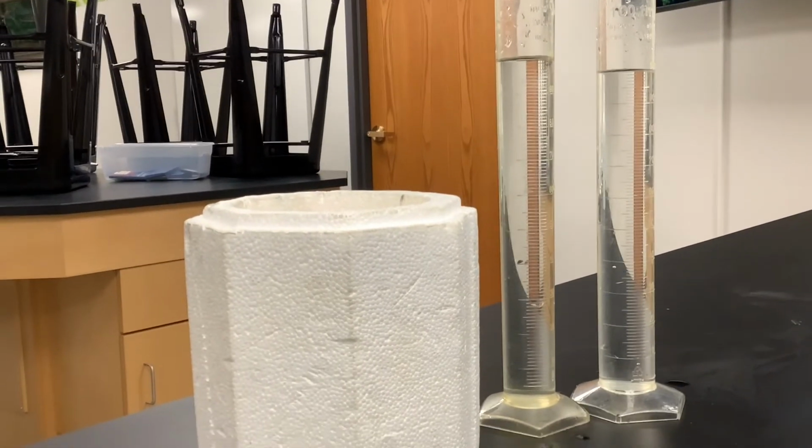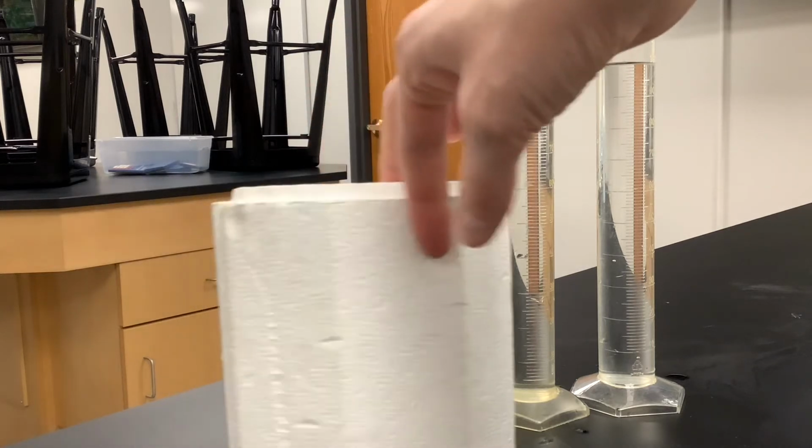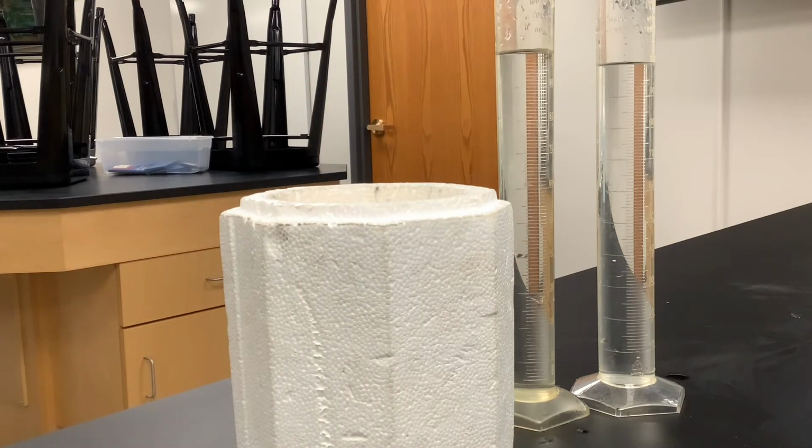First thing I'm going to do is get the mass of the calorimeter water. So this is our calorimeter right here. It's just an insulated container. I want to know the mass of the water, the initial water that's going in there.